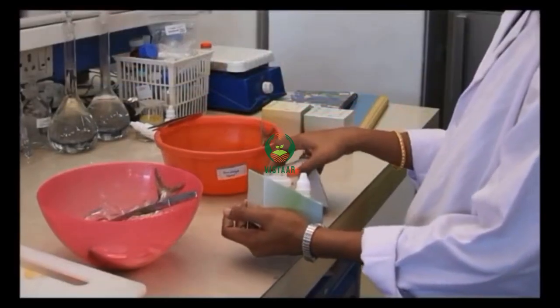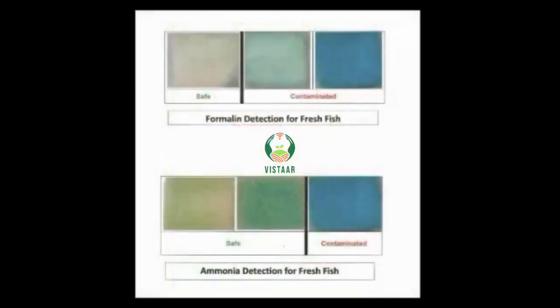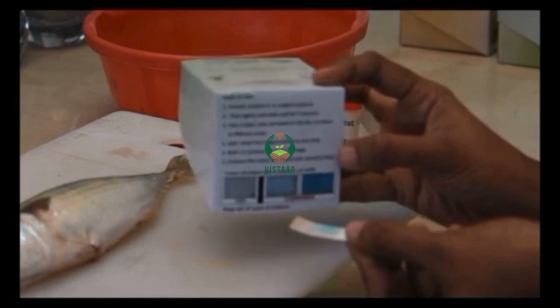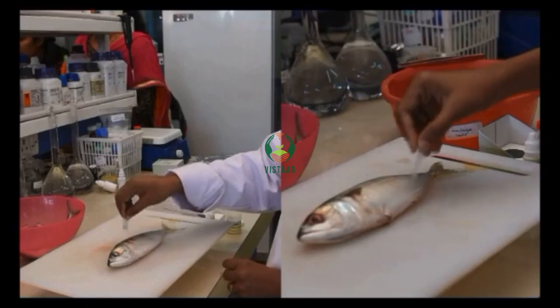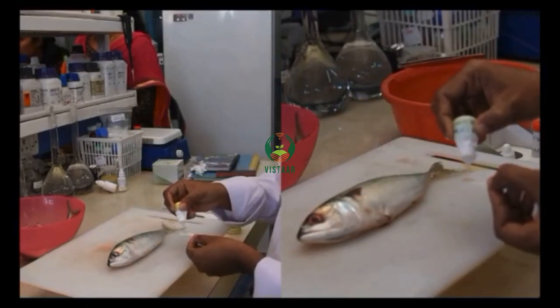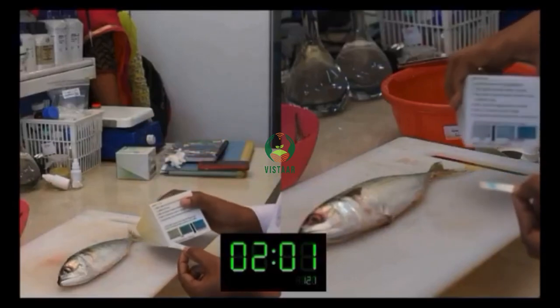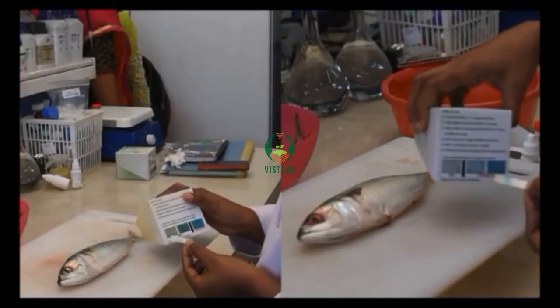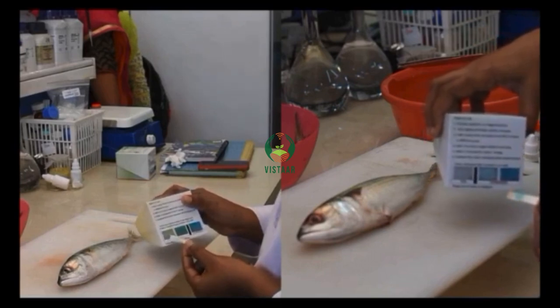How to use: The paper strip is to be rubbed on the surface of the fish to be tested, and a drop of reagent solution is to be added to that. If the targeted contaminant is present in the fish, the paper strip gives a blue color for ammonia and green to blue for formaldehyde within 1–2 minutes. The strips can also be used for meat, fillets, and loins of fish in the similar way to detect the presence of these contaminants.